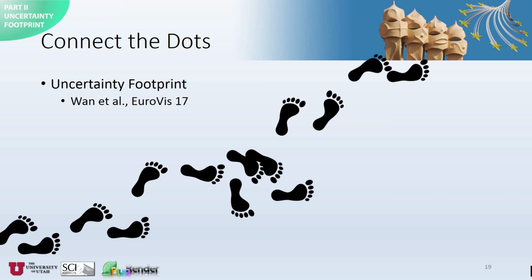The method we propose is called the uncertainty footprint. Instead of looking at the resulting data directly, it analyzes the behavior of the algorithm itself and finds whether the algorithm is confident to process a data set. If the data processing is uncertain, it also points to regions with high uncertainty. We can use the uncertainty footprint to detect tracking issues and fix them.